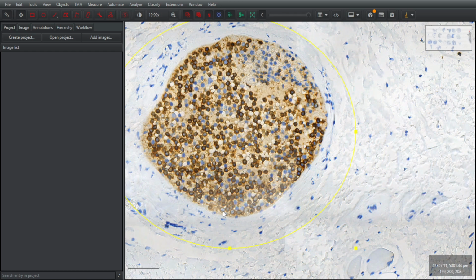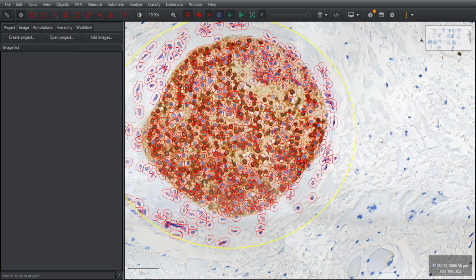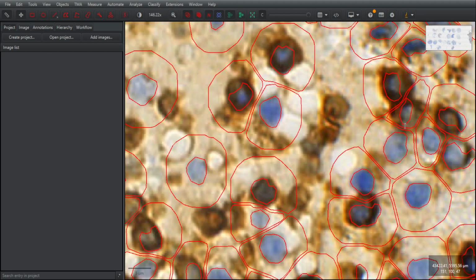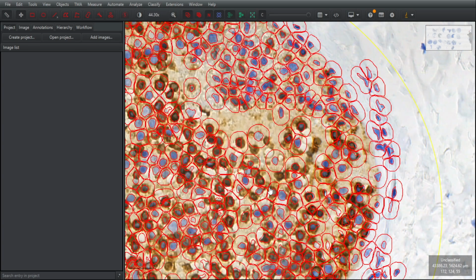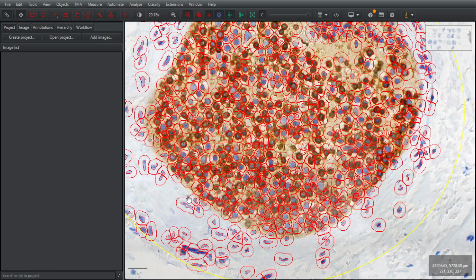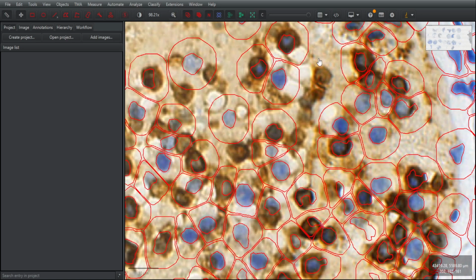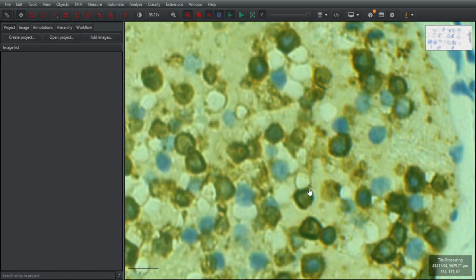First, you detect the cell, and I would love you to work on the parameters, like keeping the threshold a little lower so that it can detect all the cells. After detecting it, you can see it has detected all the cells, right? And these are the noise, so automatically it won't. But if you feel no, it's not noise, it is a cell, then yeah, you can reduce the threshold and you can see that still it's not detected. But even if you reduce the threshold, there's a possibility it can detect some other thing. So let's assume that this is noise for the time being. Okay. Let's keep it 0.09 because that's the proper one.